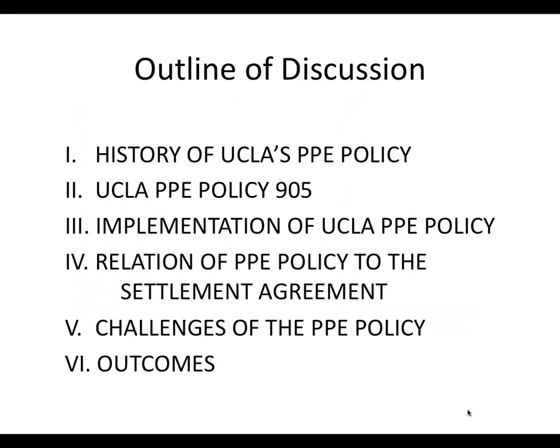So let's go ahead and get started today. I just want to go through very briefly an outline of our discussion. We have a lot of territory to cover, even though it's on one topic, PPE. It's a big one. We're going to go through a history of UCLA's PPE policy, and we will then go through the policy itself, policy number 905, implementation of the policy, and the relation of our campus policy to what's in the settlement agreement between the Los Angeles District Attorney and the UC Regents, which impacts all 10 UC campuses. And we'll go through a history of what that was all about. Then challenges of the PPE policy, especially in terms of implementation. Our researchers and principal investigators, did they get on board with this policy, and are they compliant with it? And then the outcomes of this policy. What are the real impacts of this policy on researchers' behaviors?